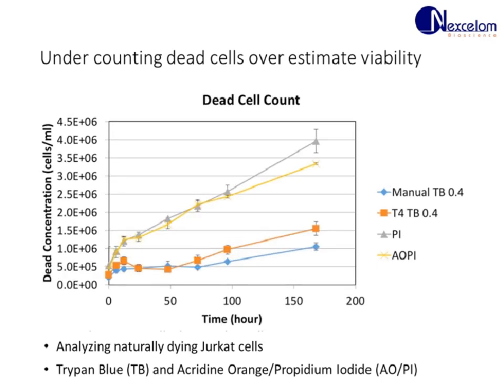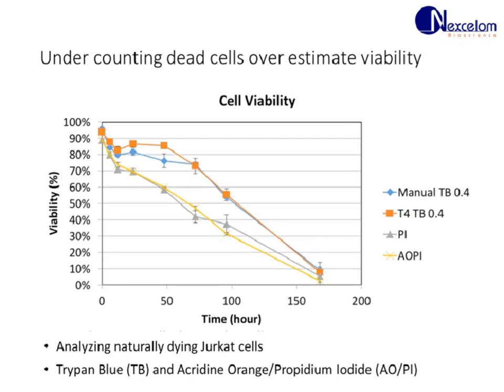However, if you look at the dead cell count, the number of dead cells counted using fluorescence increased more than double of the Trypan blue method, which is showing on the bottom of the graph. And this causes the cell viability to not decrease as fast as using fluorescence method. And we attribute that to the number of diffuse objects that's not being counted using Trypan blue, which causes the morphology to change and the colors to change, so oftentimes they're not picked up.